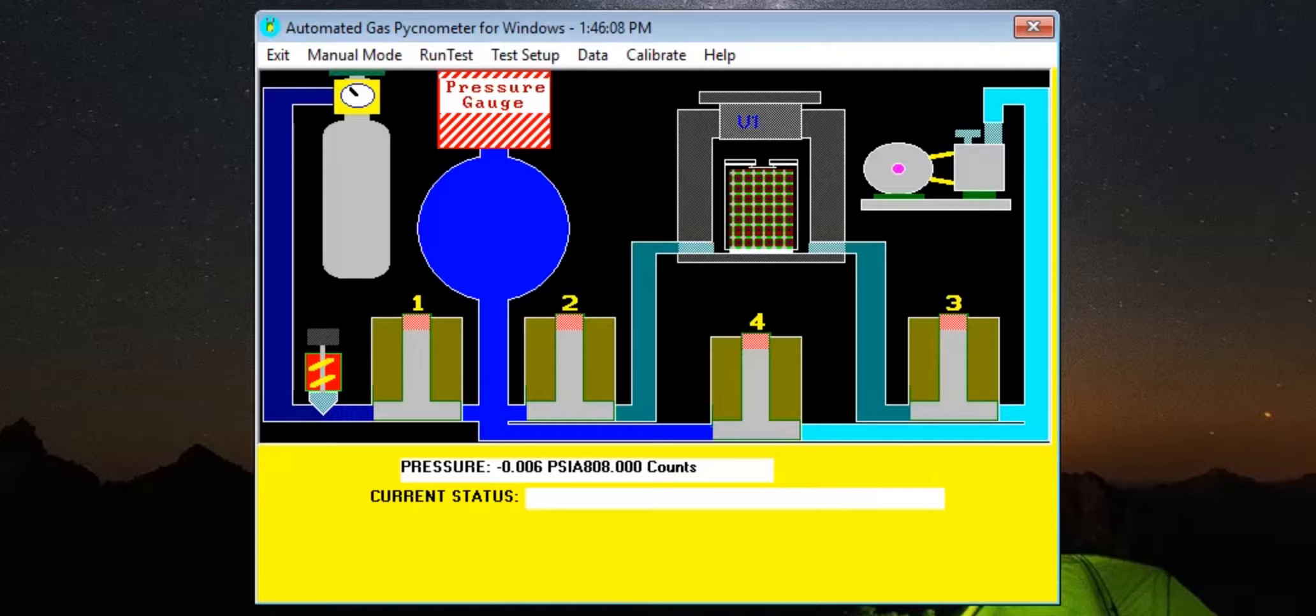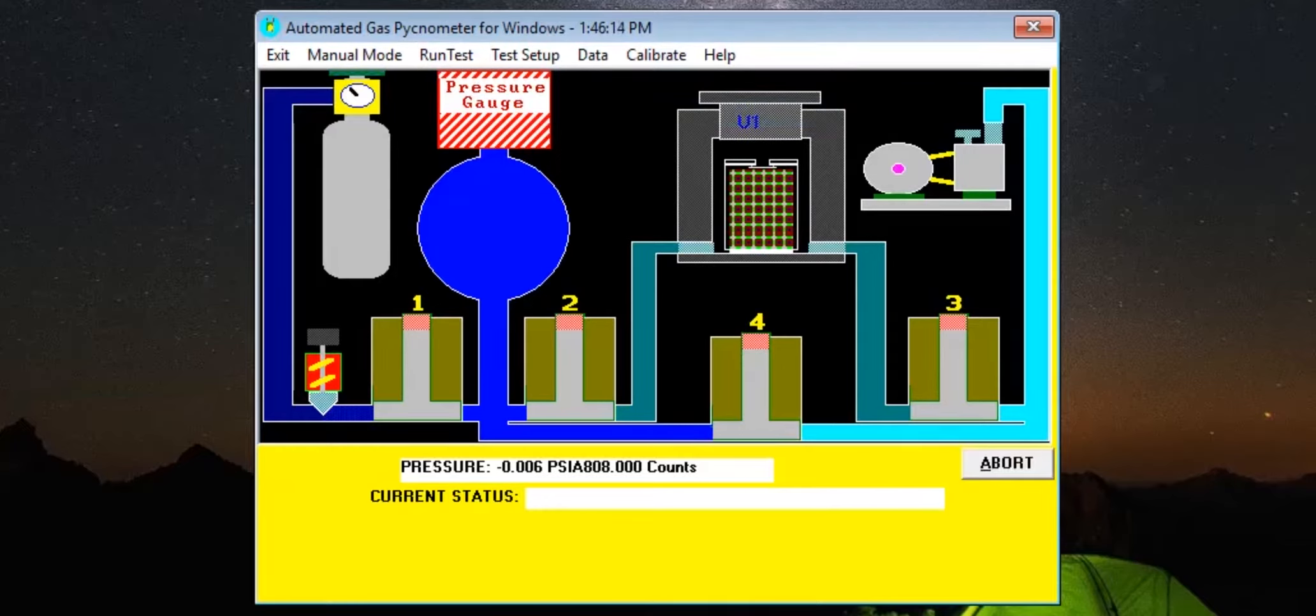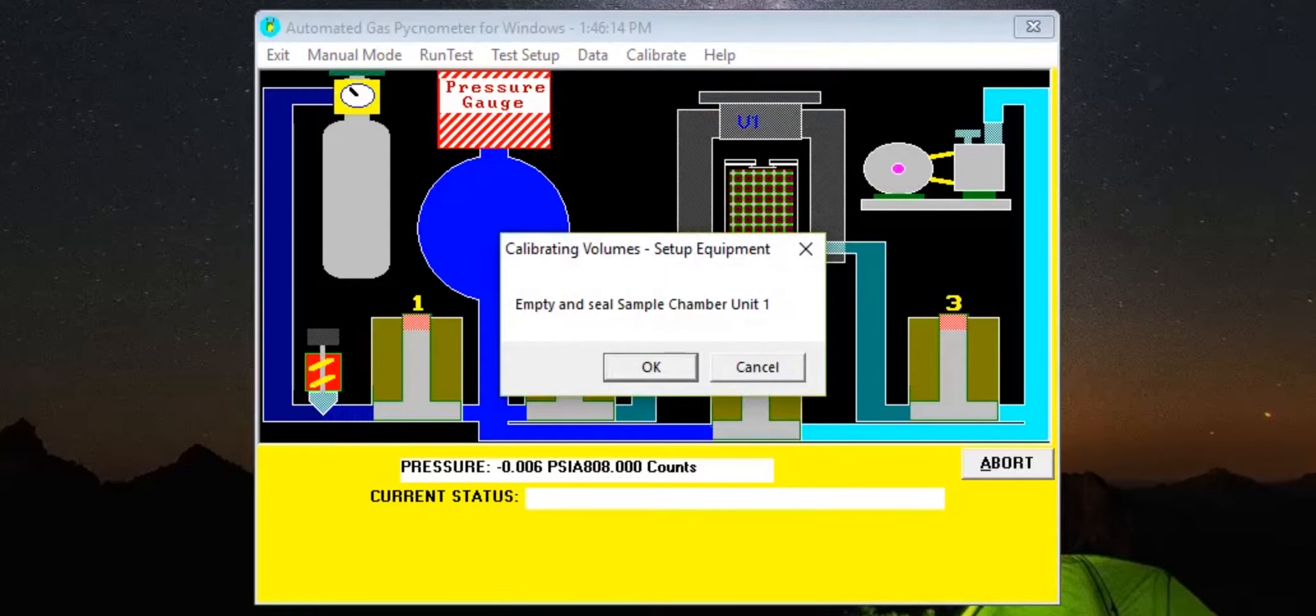To begin a calibration sequence, click the Calibrate button on the menu bar and select Volumes from the drop-down menu. This will prompt the user to empty and seal the sample chamber.